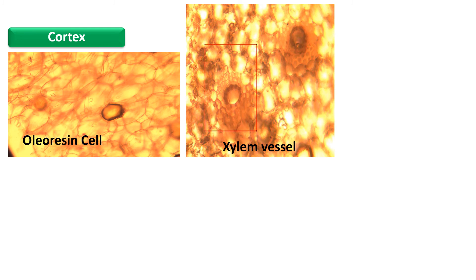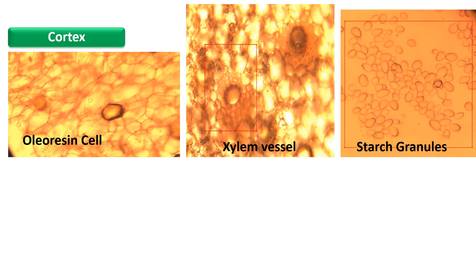The xylem vessel is important for the transport of water. The starch granules are noted easily in the transverse section of ginger. These are roughly drop-shaped, or you can say muscle-shaped.